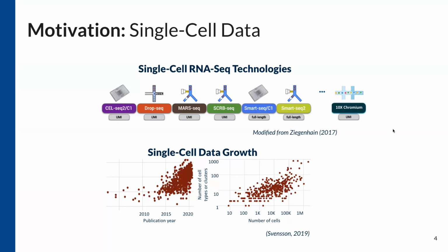One of the most popular, and one of the reasons single-cell sequencing became so cheap, was 10x Chromium. With this microfluidics-based encapsulation system, we're able to separate cells into little beads of oil and run the different experiments within each cell, or within each bubble at least.